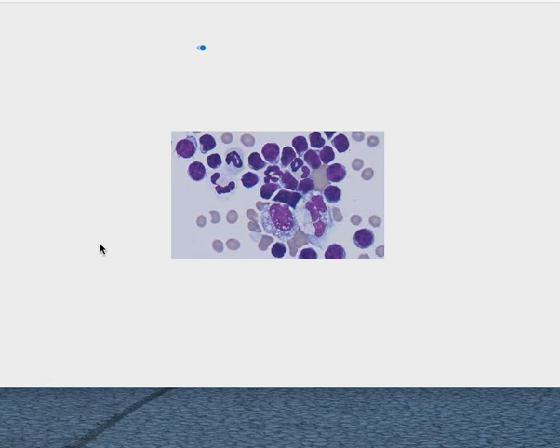Okay, your effusion is on the microscope. The doctor wants to know if this is inflammatory in nature, or is it looking more like a neoplasia? So I want you to look here and tell me how many neutrophils there are. Okay, good. There's about 4 neutrophils in this picture, right? So here they are, 1, 2, 3, 4 neutrophils. How many macrophages in this picture? There's 2, okay? And then what are these guys right here? I know this picture is small, sorry about that.